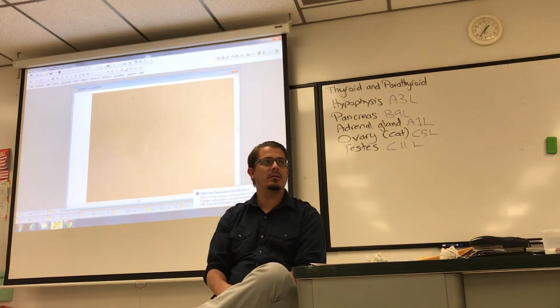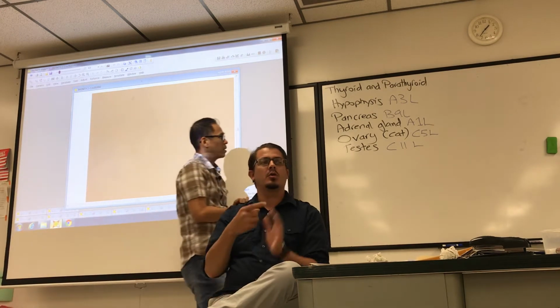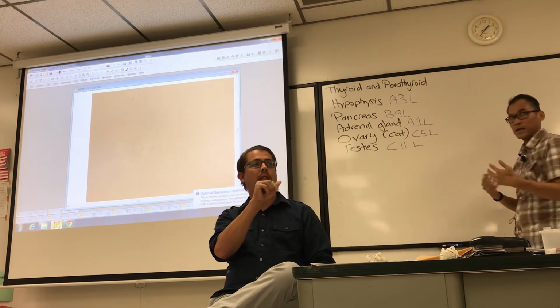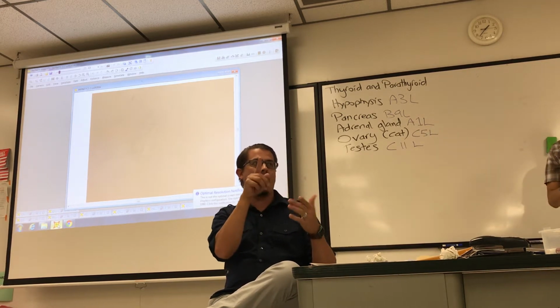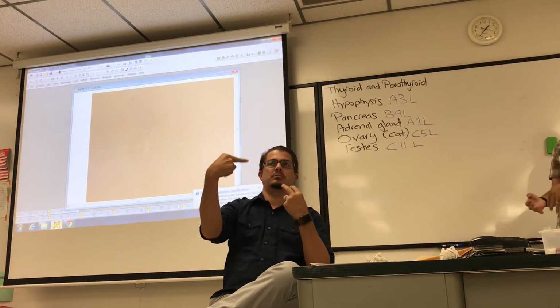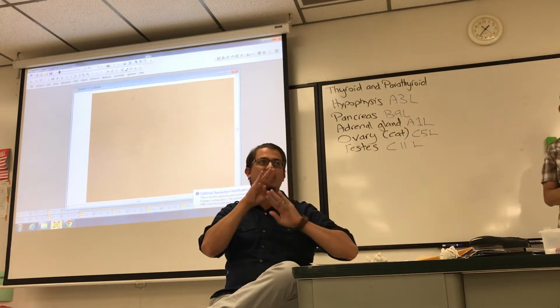But to explain something, I'm going to present the slides today. And when we have our endocrine lab on Friday, I'm going to have you identify some things. And I'm going to check you off. I'm going to make sure you can use the scope and get these things in focus. But today you'll get a chance to see me do it. You'll be like, oh yeah, that's easy, no problem. I think you'll find out it's a little more frustrating if you're not used to working with scopes.